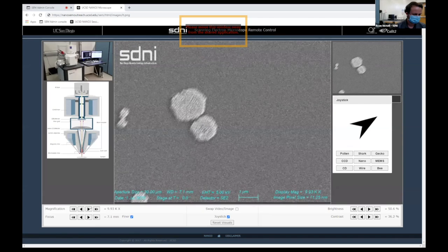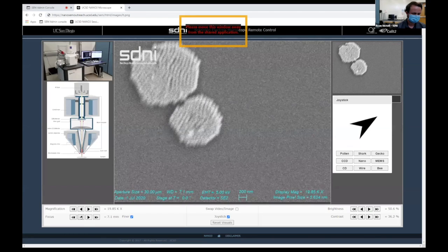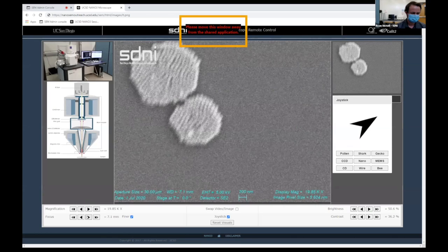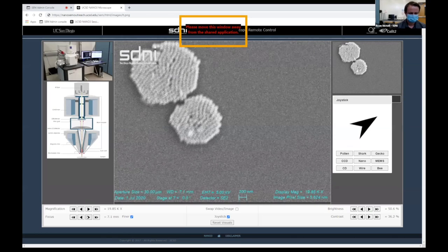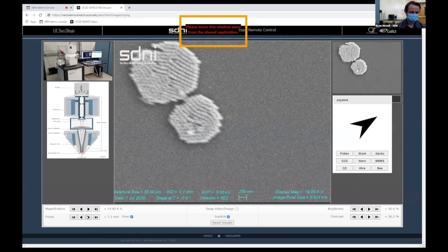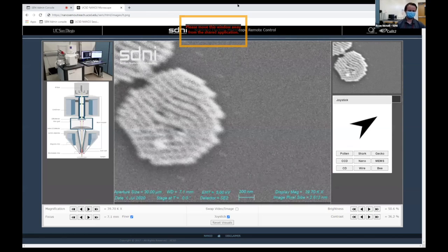I wanted to add, Vicky had a good question: why is it possible to see anything in color? This is so cool. And I don't know, Ryan, do you want to answer that? Angela, if you want to take a stab at it, I won't stop you, but I'll certainly. I think you should answer. You're the expert here. All right.